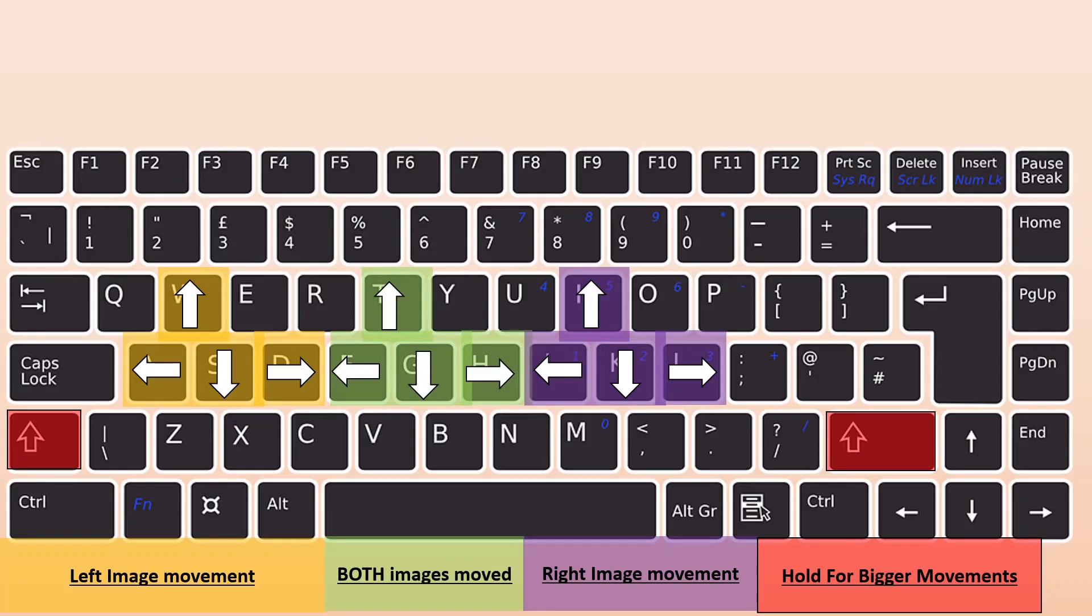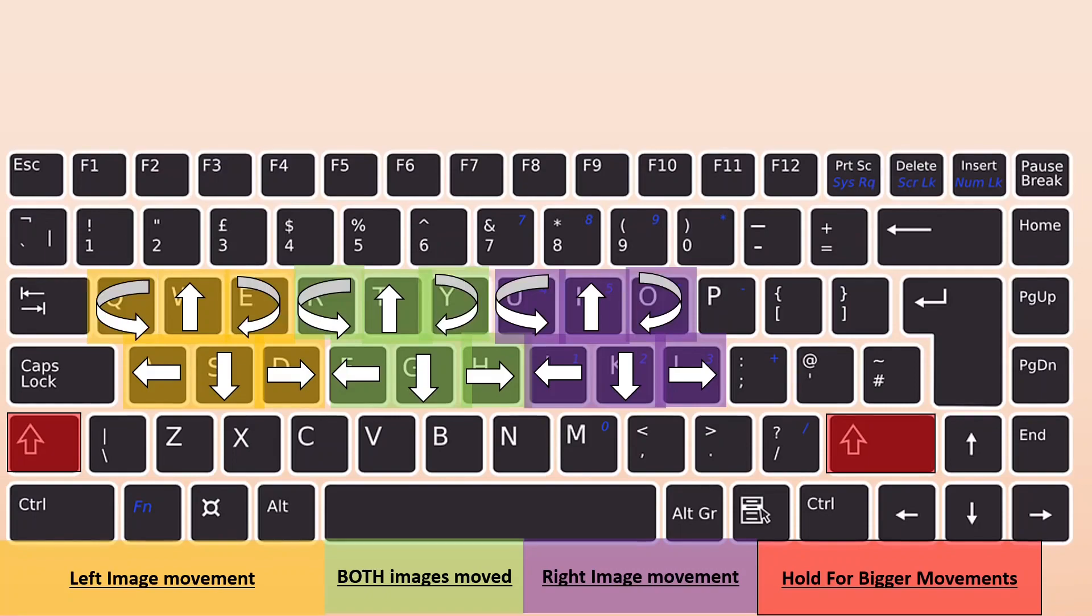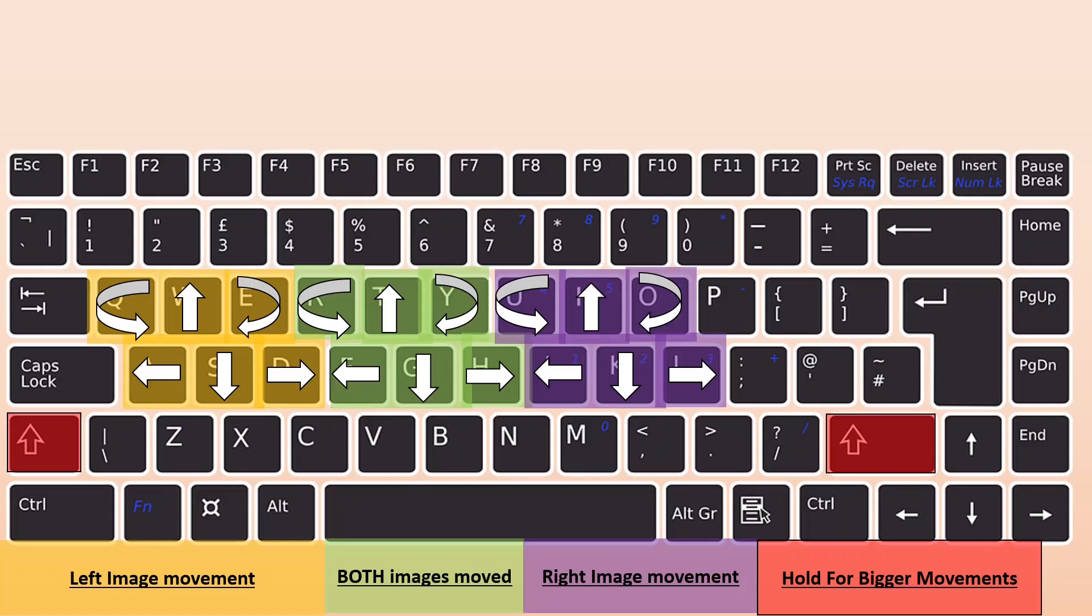You can also rotate the images. This is going to be helpful with cartridge cases, which you have to figure out what the correct orientation is before you compare it. The Q and E keys will rotate the left image, the U and O keys for the right image, and the R and Y keys for both of them together.